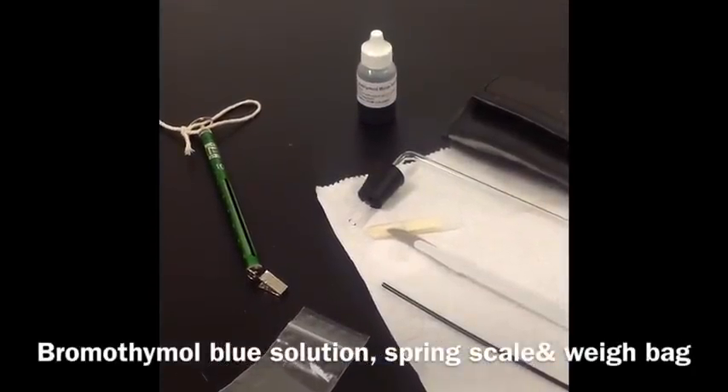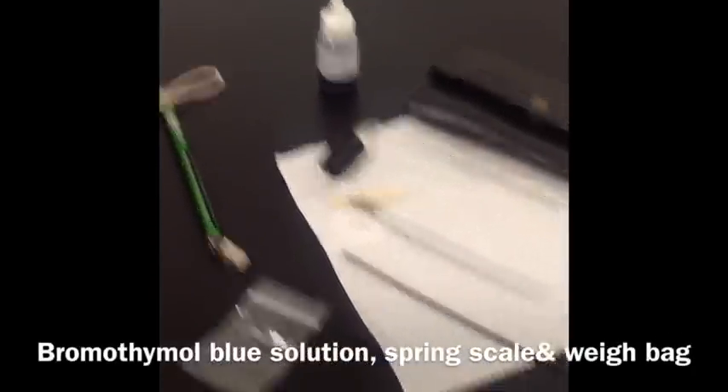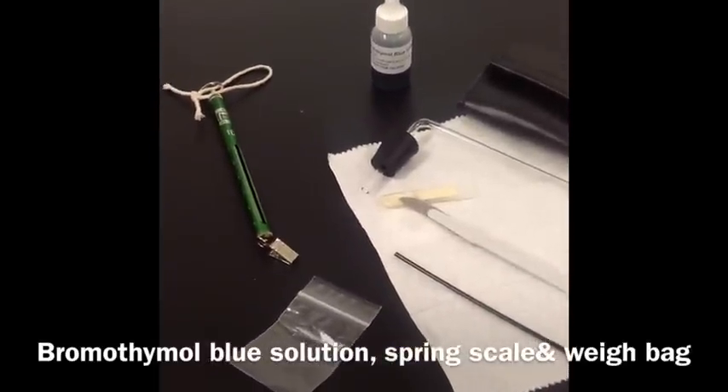The bromothymol blue solution is used in the second half of the experiment. Be sure to have your spring scale and weighing bag handy.